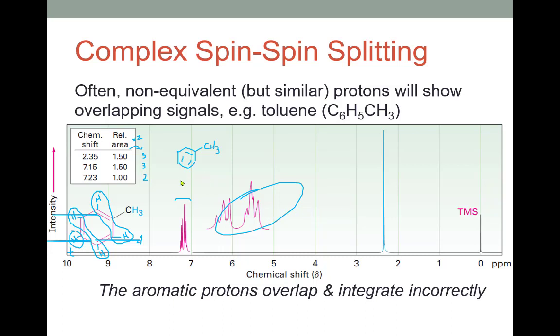Altogether, we do have 5 protons, but they're being lumped together in a strange way. So probably the 2 represents these shoulder carbons' hydrogens first, and then the 3 integration is probably this other stuff that's just too close together to integrate properly.